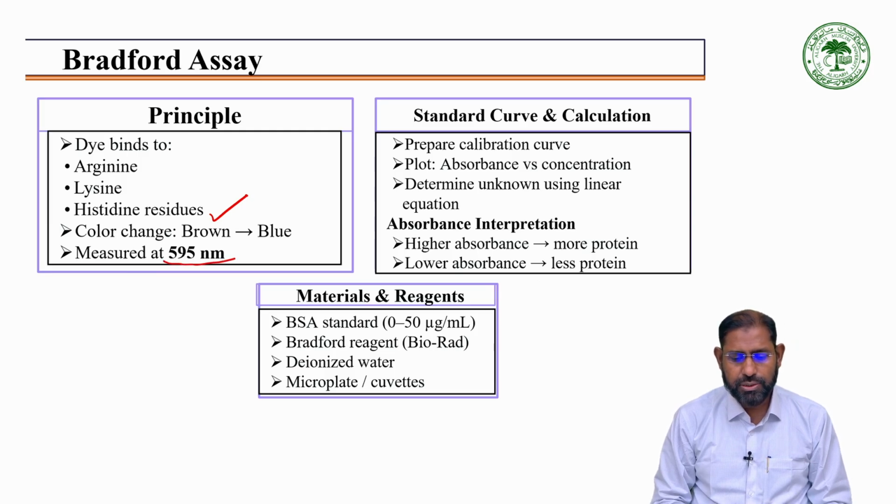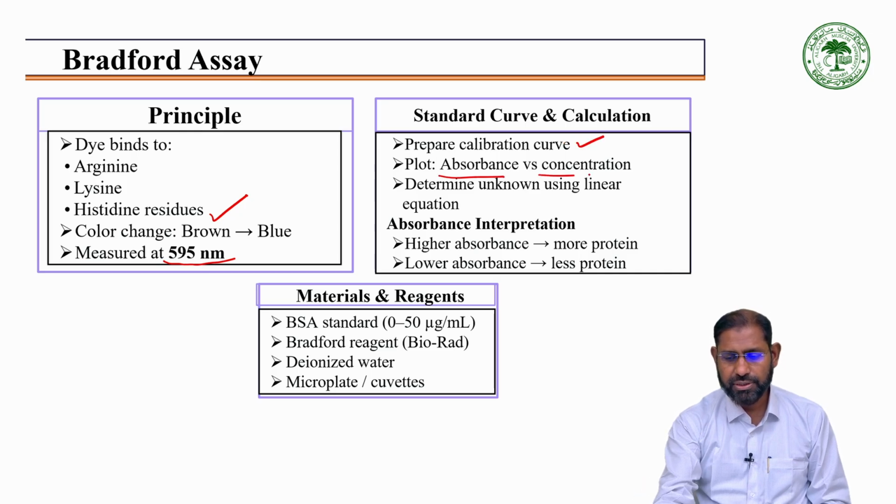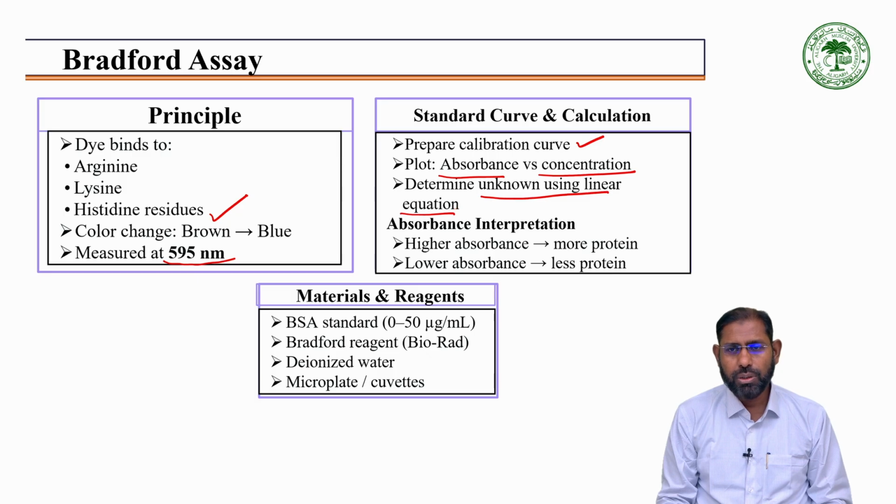In this case we also prepare a standard curve. We prepare the calibration curve, plotting absorbance versus concentration, and we determine the unknown using the linear equation.